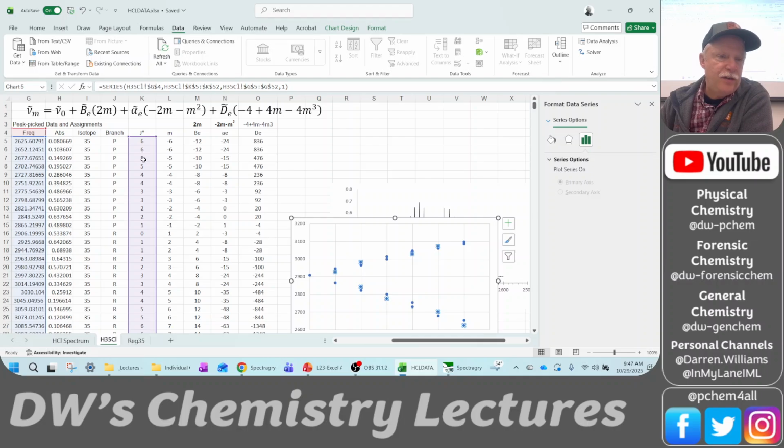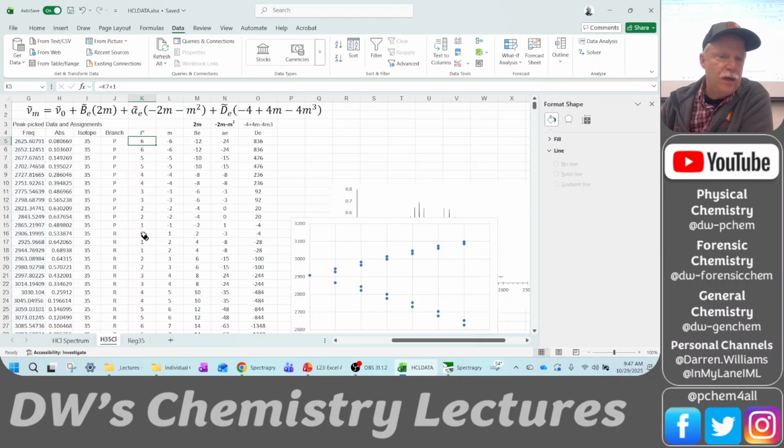Yeah, so the J values are all messed up, because this is still a formula. I put formulas in for my J value. So this is P1, okay, it's not a formula, so I can rely on that. P1, and then this was 2, this should be 3, and so it was the formula that I did.